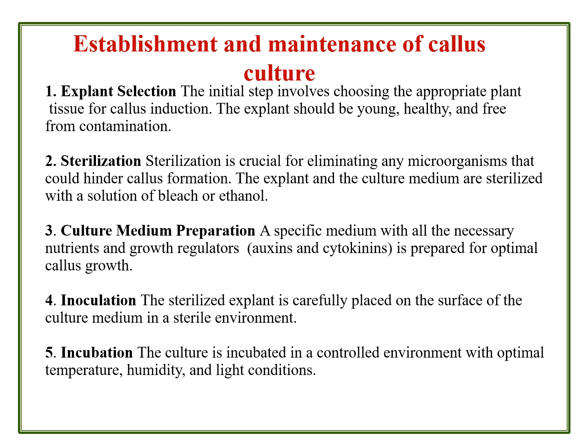The laminar airflow chamber is already switched on prior to taking the medium from the autoclave to the culture room, and it is already sterilized with UV radiation. Here the physical radiations are applied on the surfaces of the laminar airflow chamber, the laminar airflow cabinet.